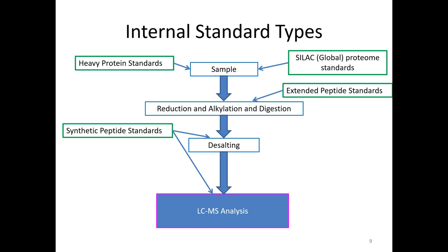When you have isotopically labeled peptides, but the incorporation is not 100%, then what you have is appearance of the underlabeled forms showing up here. And there's a broader distribution of this because it's not fully and purely isotopically labeled. So when you go to isolate it, you might isolate the most intense peak, but that might not be the fully labeled isotopically incorporated precursor.